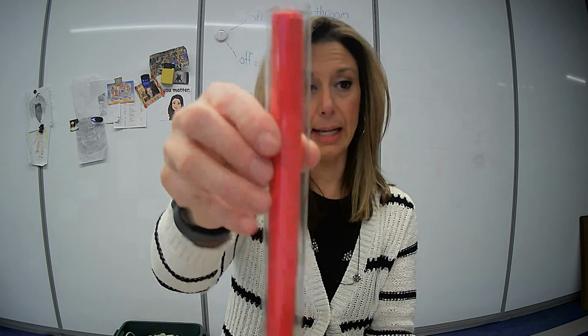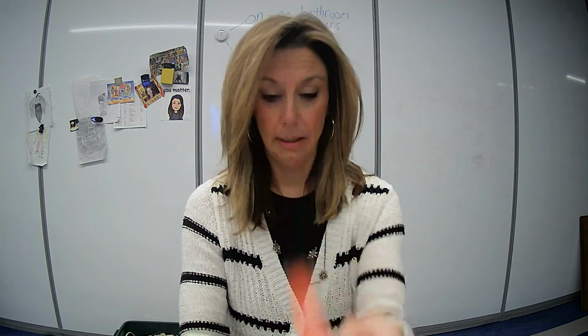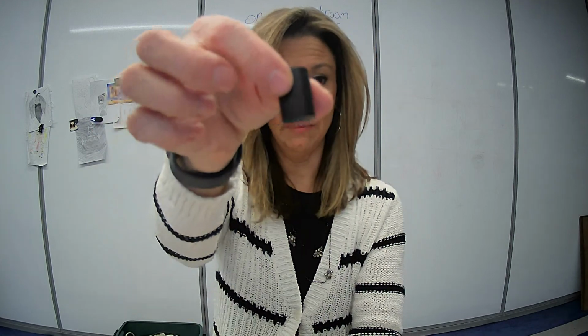So you've got different sizes: a small one, a medium size, and gradually they get a little bit bigger, but they're the same material in the tube. This one is all the same material. I just grabbed one for our example. So there's 1, 2, 3, and 4.